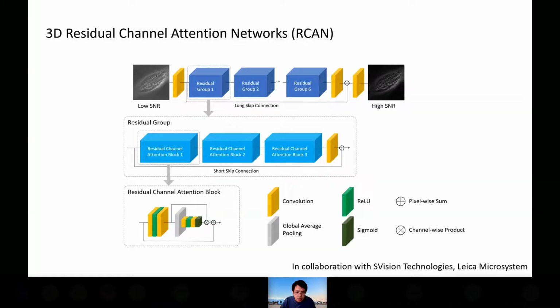So through a collaboration with an excellent team led by Luciano from S Vision Technologies, we extended the existing residual channel attention network, RCAN, into three dimensions, so we call it the 3D RCAN. For image denoising, that's what the first one tries to solve.